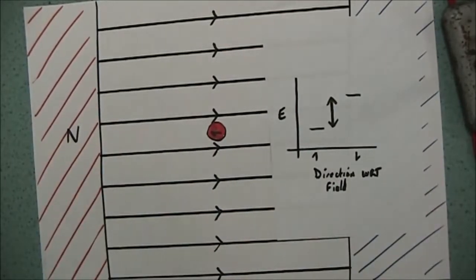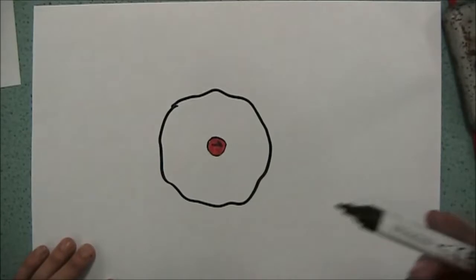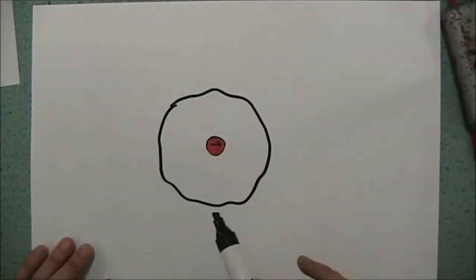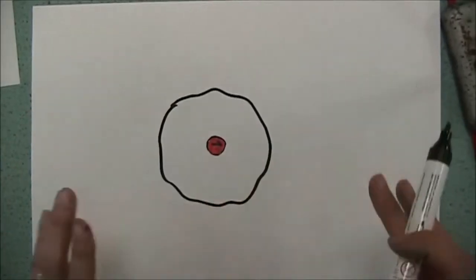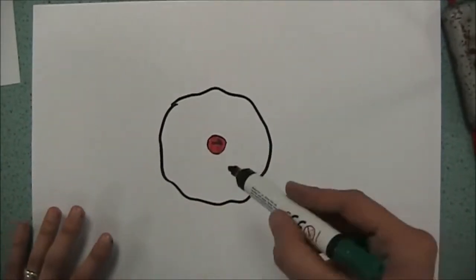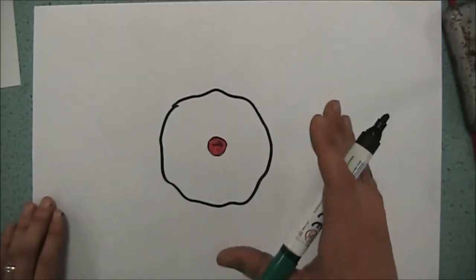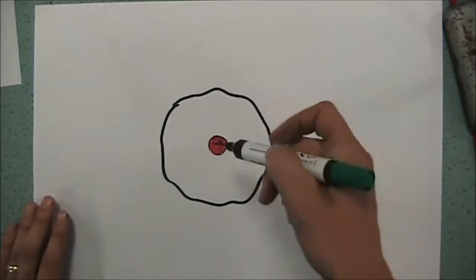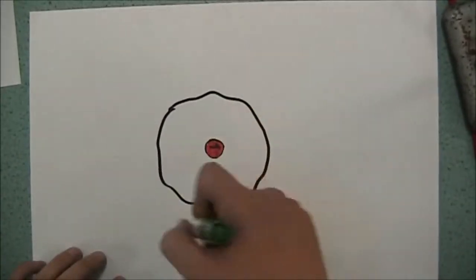So what affects that strength? Well, the nucleus isn't alone, and what the nucleus has around it, of course, is a cloud of electrons. Now when you're thinking about this cloud of electrons, they are obviously in their shells, they are all around, but they also do have spin. So when my atom encounters the magnetic field, the nucleus is actually to a certain extent shielded from the magnetic field by electrons.